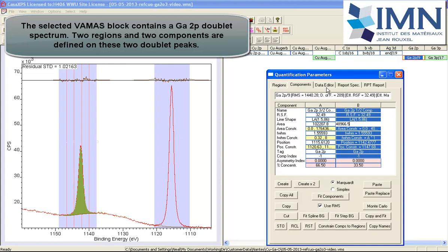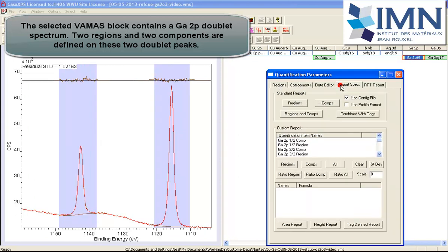This will allow us to look at the same pieces of information about the FWHM, the maximum, or the area or the height of these peaks based on regions or components.